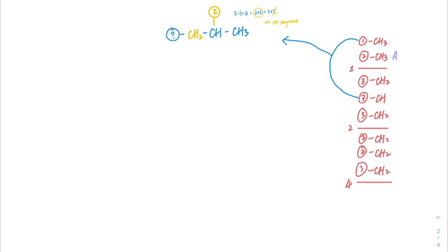So let's continue. What are the other groups that can be linked together? So let's see this A, and then what else? It has 2 neighbors, and I have a bunch of CH2 next. So who is my neighbor? We have 3 different CH2, and one has 3 neighbors. So this CH3 is the 3-hydrogen neighbor of this A prime CH2.